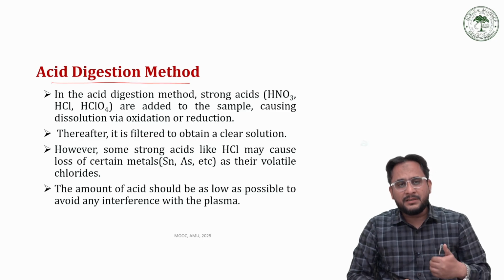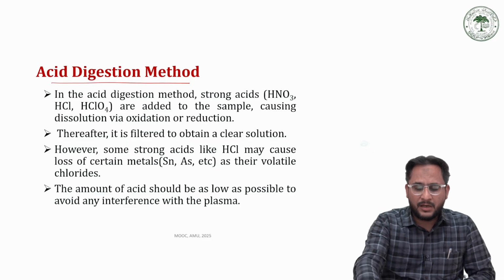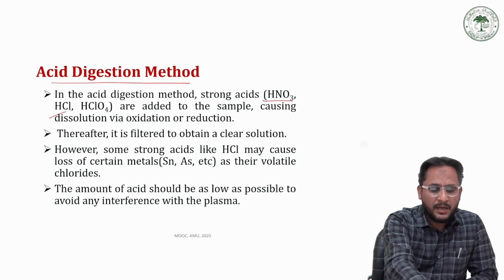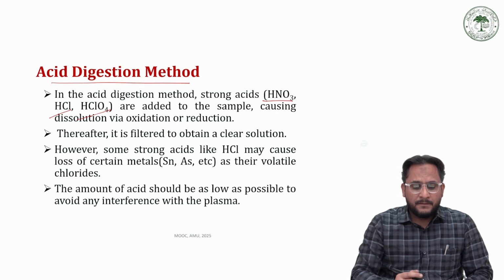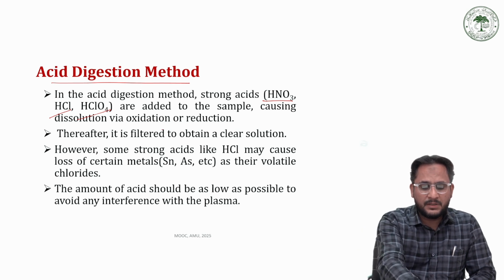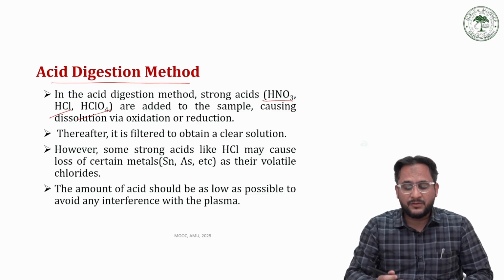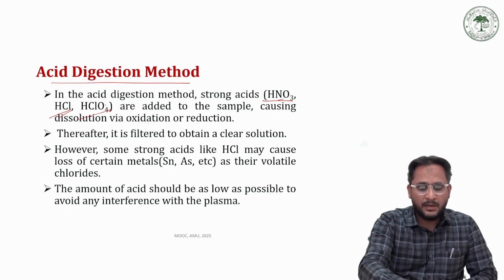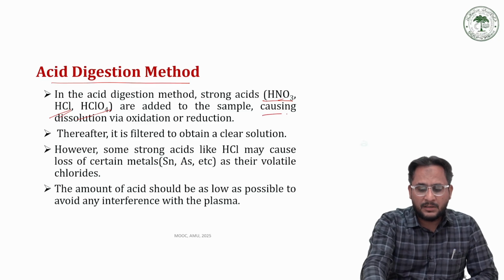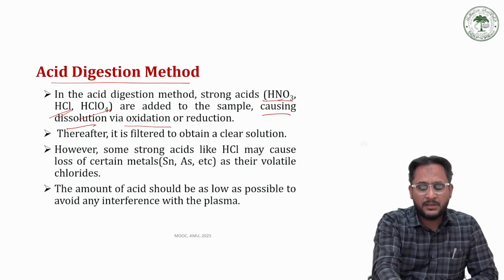In this method, the sample is digested, or mixed, with strong acids like HNO3, HCl or HClO4, which causes the dissolution of the sample matrix via oxidation or reduction.